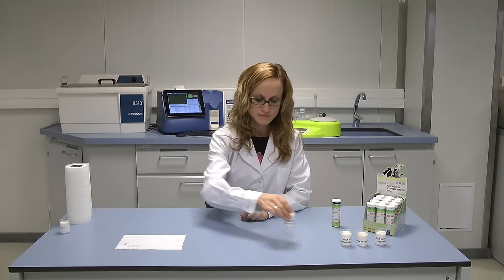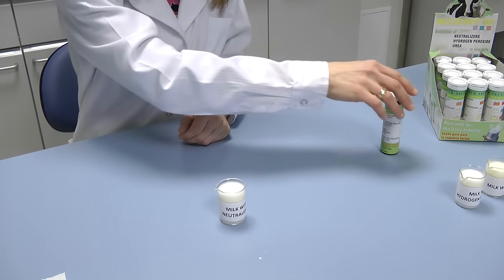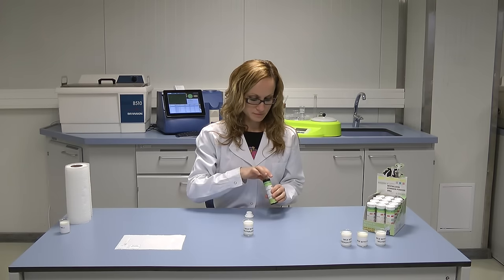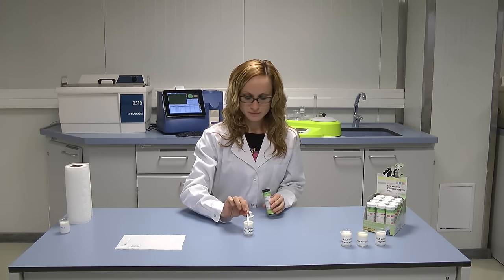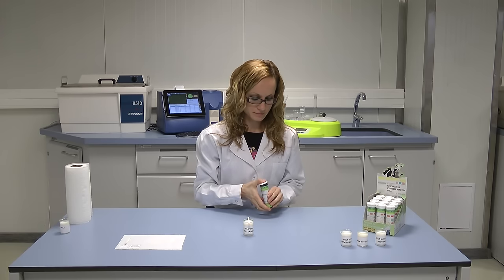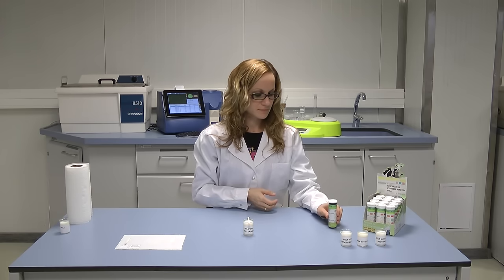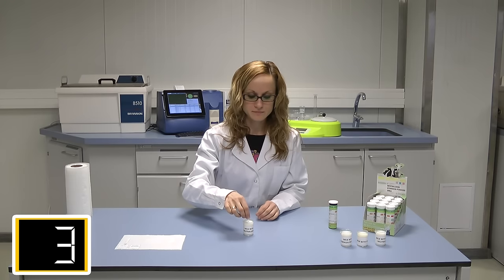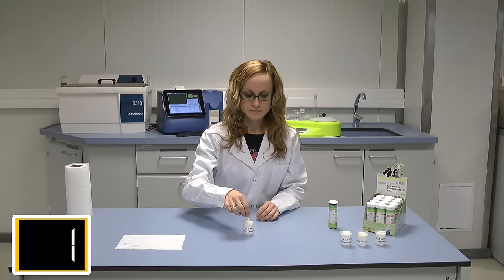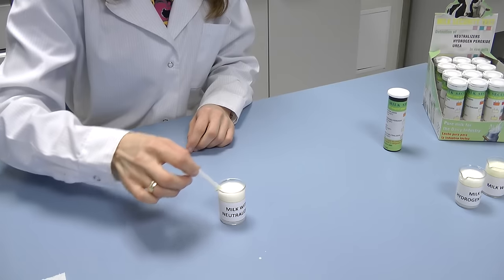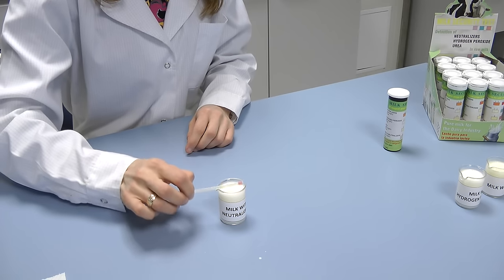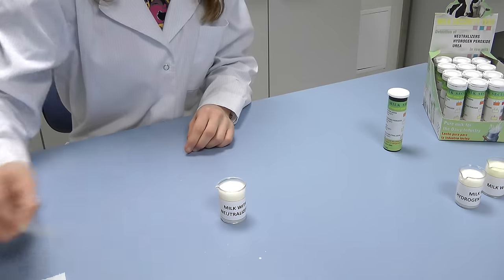Second sample is milk adulterated with neutralizers. The most common neutralizers that are used for adulteration of milk are sodium bicarbonate, sodium hydroxide and sodium carbonate or hydrated lime. They are often added to milk for increasing the lactometer readings. Neutralizers influence the values of titratable acidity and pH of milk. That's why they must be checked in the milk sample.